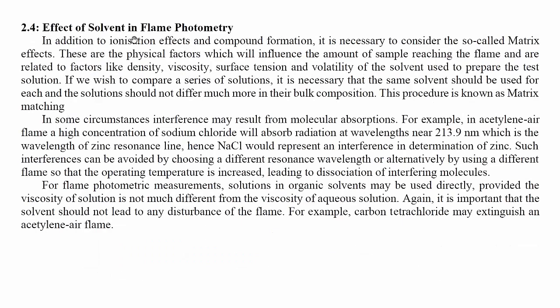2.4 Effect of solvent in flame photometry. In addition to ionization effects and compound formation, it is necessary to consider the so-called matrix effects. These are the physical factors which will influence the amount of sample reaching the flame and are related to factors like density, viscosity, surface tension, and volatility of the solvent used to prepare the test solution. If we wish to compare a series of solutions, it is necessary that the same solvent should be used for each and the solutions should not differ much in their bulk composition. This procedure is known as matrix matching.